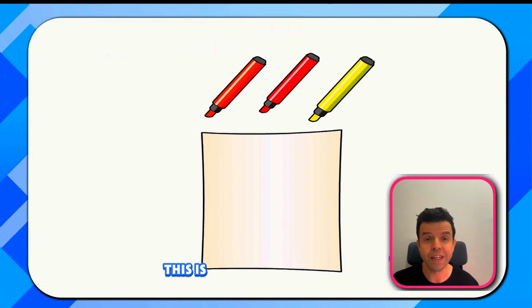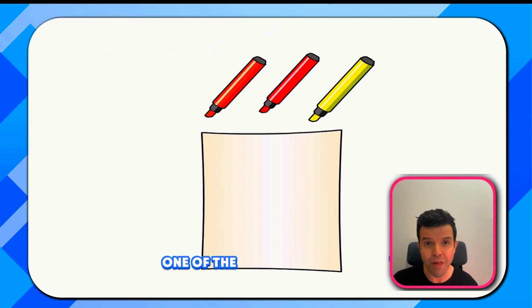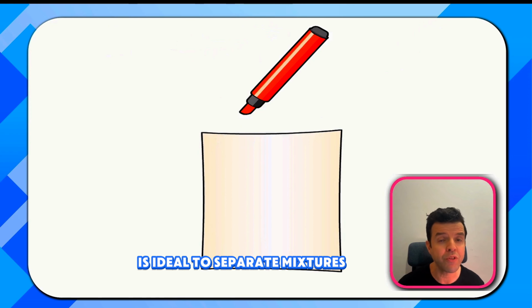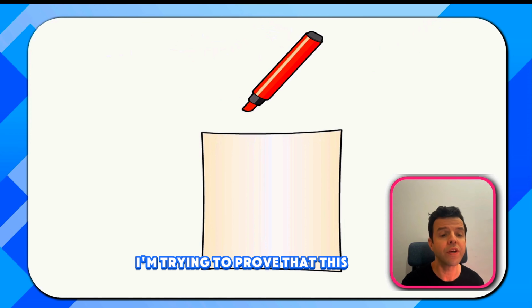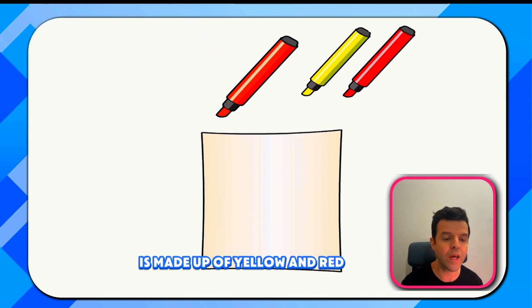This is IGCSE Chemistry and we're working today on chromatography, one of the methods of purification. Chromatography is ideal to separate mixtures that are colorful. In my example here, I'm trying to prove that this orange marker is made up of yellow and red colors.